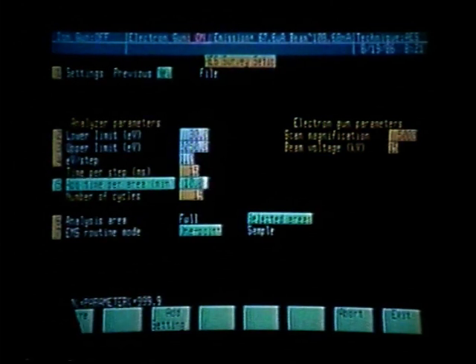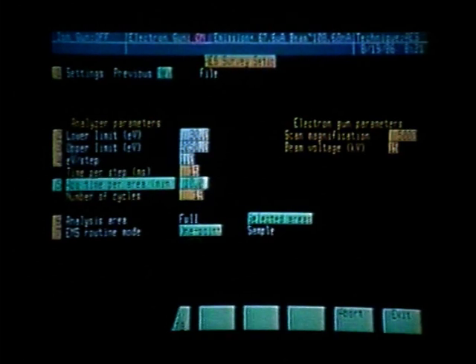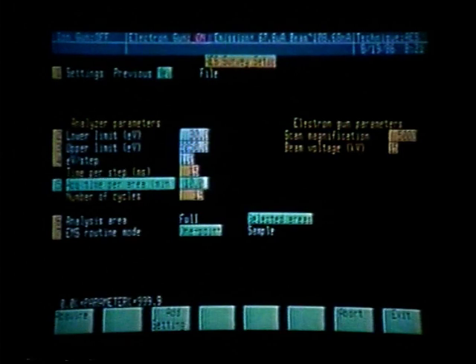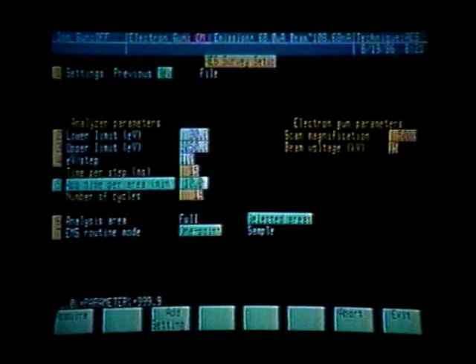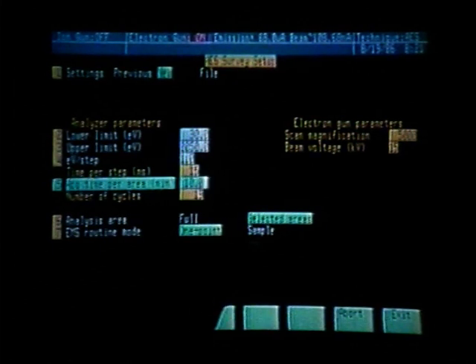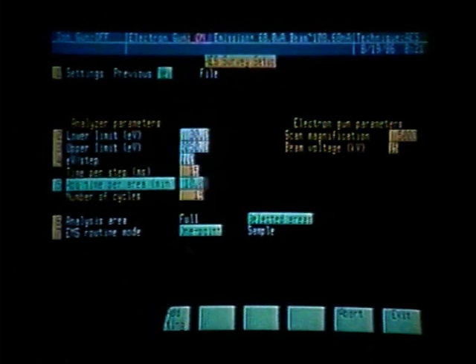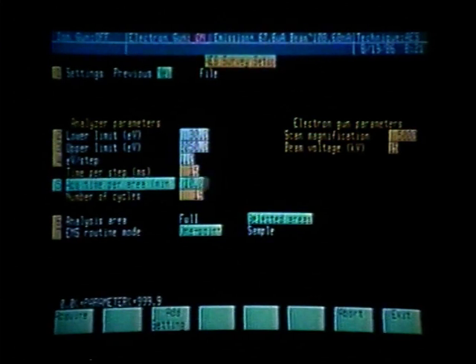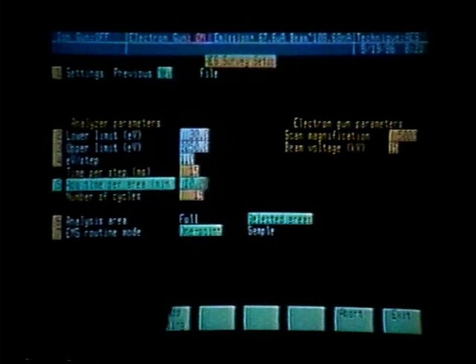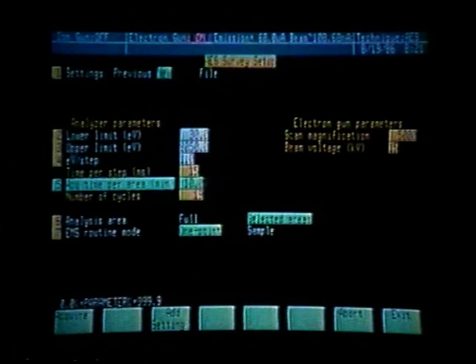Line 7 asks where we would like to calculate our EMS routine. Right now we have our EMS routine on one point, meaning it will set up the Auger multiplier while looking at area number 1. We could also have it set up the multiplier while scanning at TV rate over the whole sample — that would be toggling number 7 to sample mode. Since area number 1 has a high Auger yield, I will allow the multiplier to set up in the one-point mode to assure we do not saturate the multiplier. We can then exit the survey setup mode using soft key number 8.